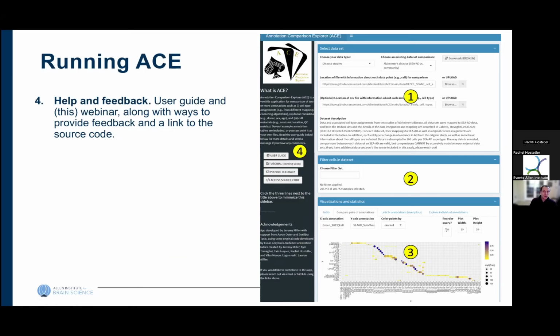There's an extensive user guide that will go into all the stuff that I'm talking about now in more detail. A link to the tutorial, which will likely just be a link to this webinar, but we may end up creating other more focused video tutorials at a later time. I would love feedback. So if you do use this tool and there's anything you like or don't like about it, click this button and it will open up an email to me, or you can go to GitHub and submit an issue there. All of this is based off of a GitHub repository so you can download this on your computer and run exactly the same thing that you see on this website if you're someone who would prefer to work that way.